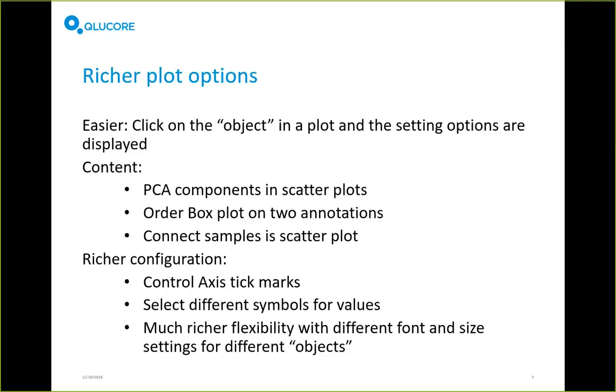Previously, there has been less configurability on our plots. In this release we've added quite a bit of new options to let you control the font, for example, or control how a plot is rendered on the screen and in the export.